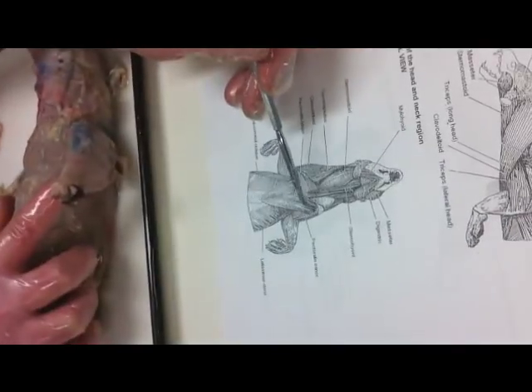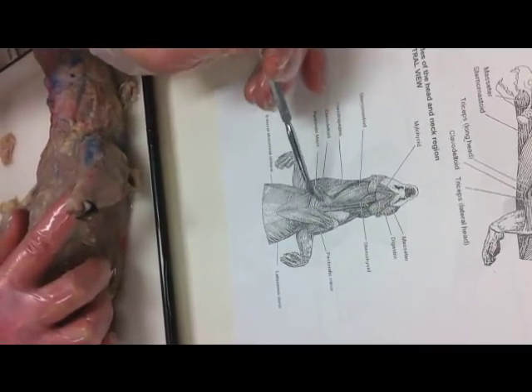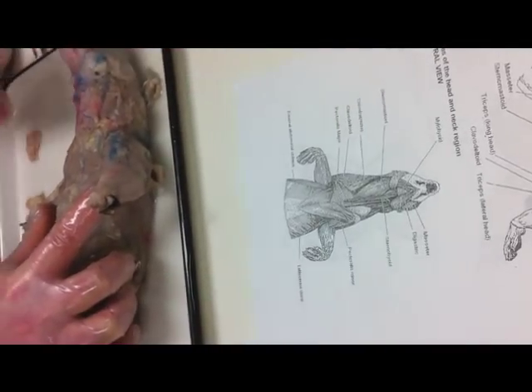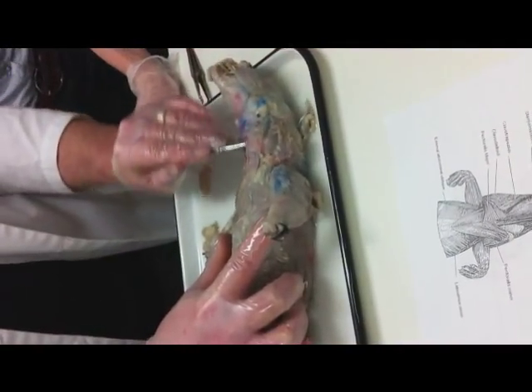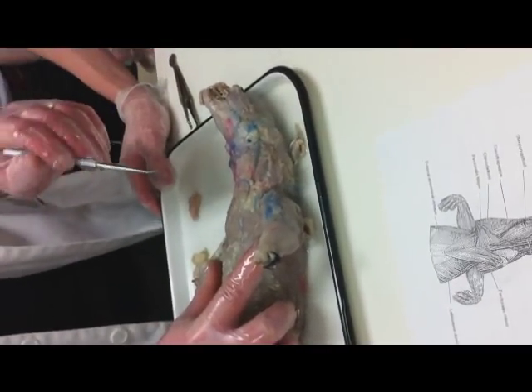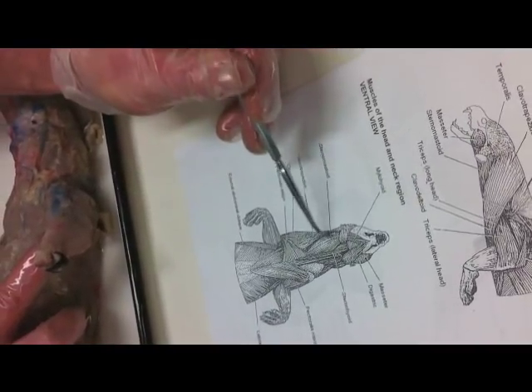So here's his pectoralis major. Oh, sorry, here's his pectoralis major. Here's his pectoralis minor. In the picture, they've cut one major away so you can see underneath, but you don't have to do that. All right? This large muscle here covering his throat that has been cut in all of your minks, they were cut so they could inject it with dye. This large muscle here is the sternomastoid.